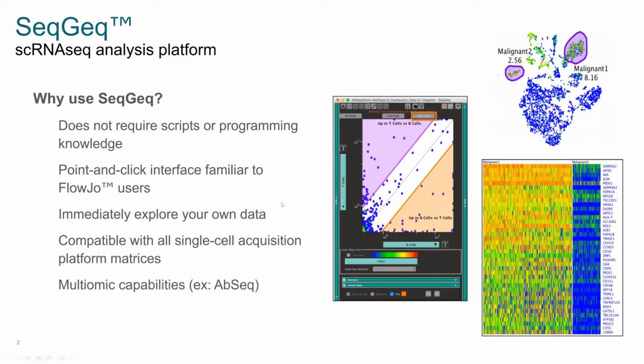I think that's where a lot of holdup often happens. Once we invest money into designing an experiment and doing a single-cell RNA sequencing run, we end up with all this data, and it's a little overwhelming how to get started if you're not a bioinformatician or a trained data scientist to deal with such large data sizes. So what is out there for the run-of-the-mill bench scientist who doesn't have those skills at the moment, but wants to tackle the data they've gotten from a single-cell RNA sequencing experiment?